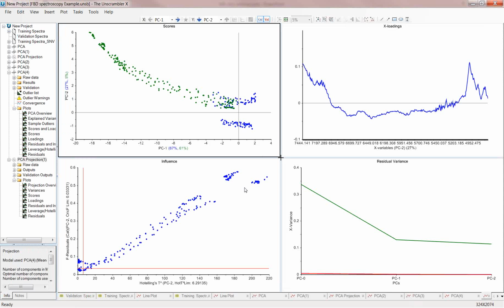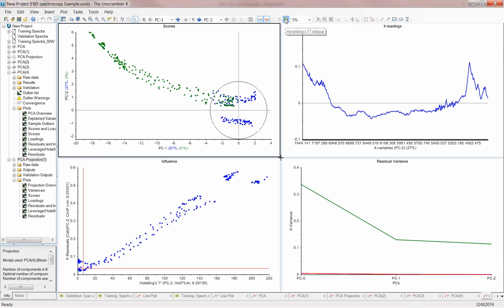Now this is going to show the entire batches, and we can go ahead and put our ellipse on here, and we can see this is not dry, it's not at the endpoint, not at the endpoint, but once it crosses over and stays inside this Hotelling T-squared ellipse, we can determine that it is definitely dry.